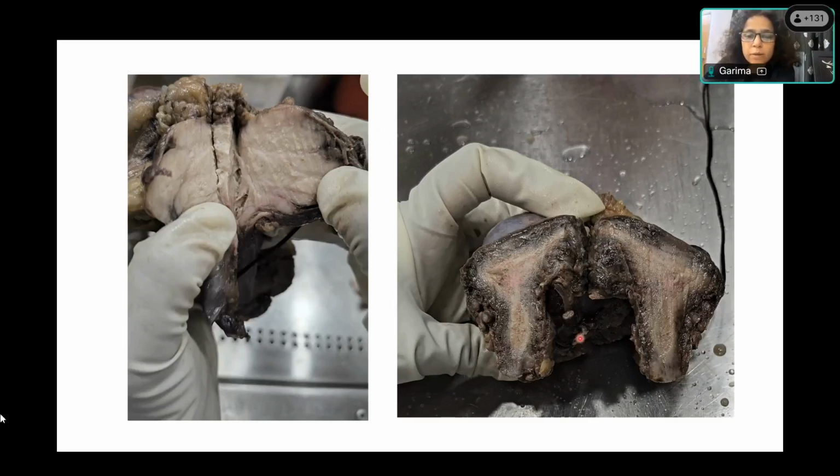So till the time I'm presenting this case, we did not have the karyotype, but they were expecting it to be 46XY. So they were just waiting for the karyotype of this patient. So this patient had a gonadal dysgenesis and Mullerian remnants, and this was the uterus, which they sent as a uterus-like structure. And this was the seminoma. So you can see the lobular pattern, gray-white, uniform appearance here.